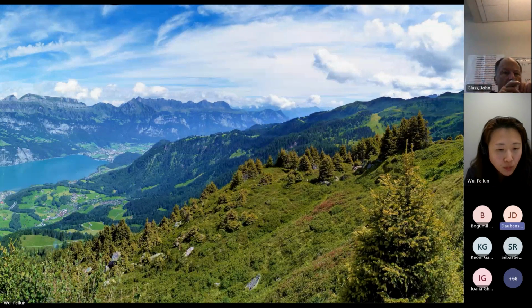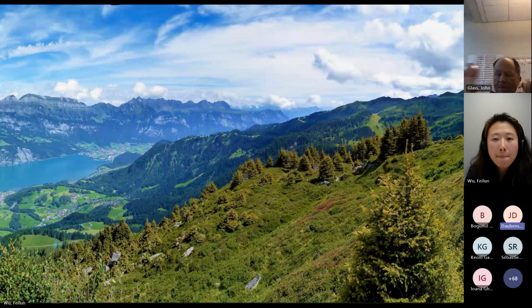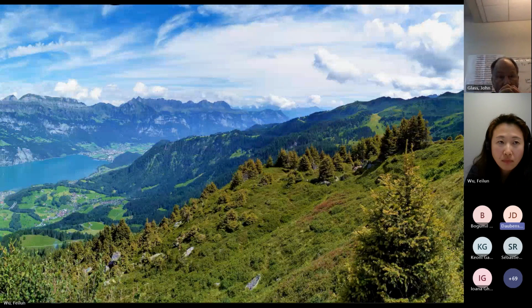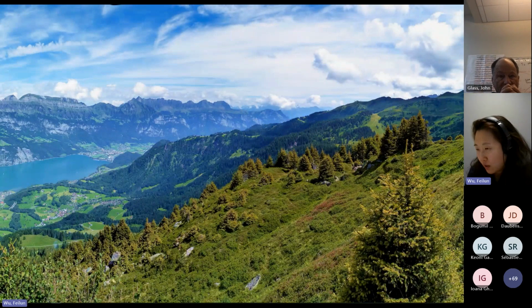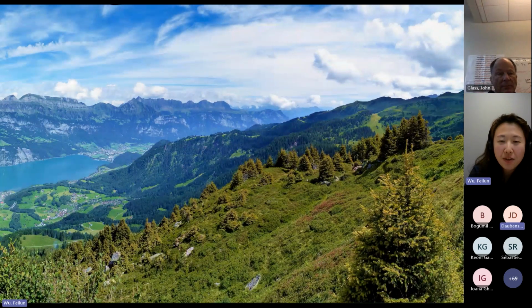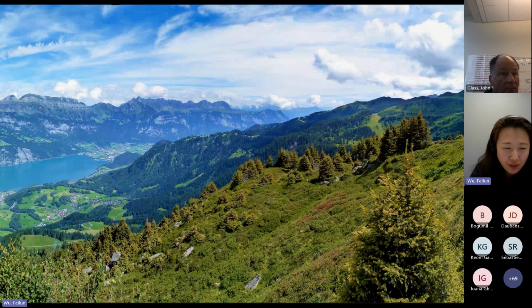Well, the general assumption is that PEG, or polyethylene glycol, pokes holes in the membrane, right? I'm not sure exactly of the mechanism by which MMC enters the cell, but if it's entering the cell and being sequestered somehow, then poking a hole in the membrane and doing the wash step might eliminate any residual MMC inside the membrane. So you're suggesting a deep wash of the cell to get rid of even internal mitomycin C that might be floating around.